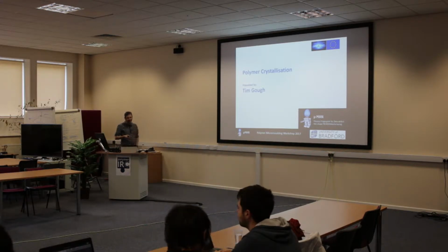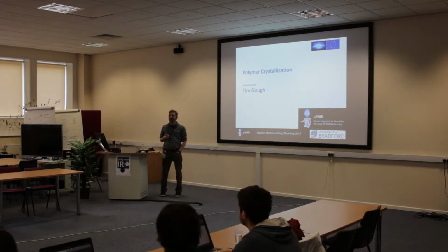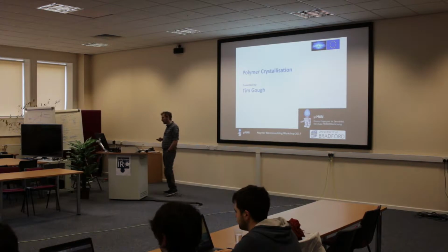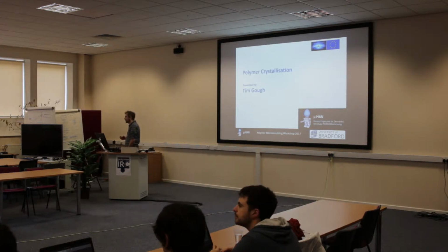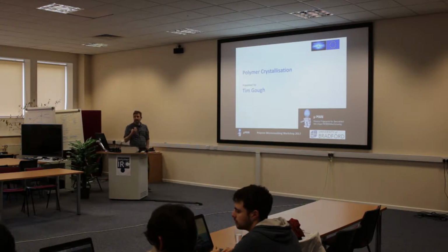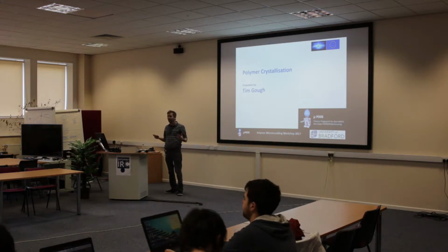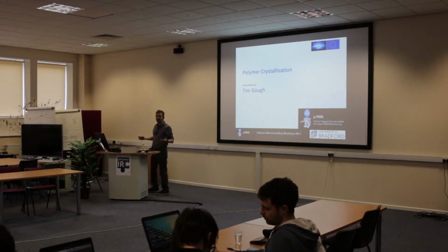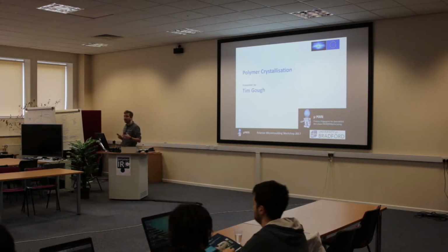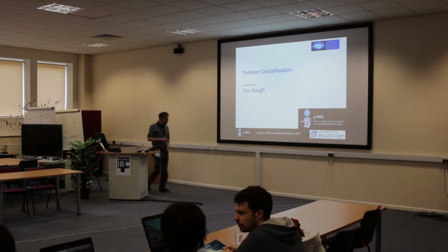Right, okay. So before doing lab sessions on thermal analysis and some X-ray scattering, the thermal analysis is all about crystallinity and thermal transitions, and the X-ray is about structural analysis. It's all very well saying we get crystals, but what are they? We don't know what they are. We can't pick that up from simple thermal techniques. Anyway, we'll take a little drive through that now.